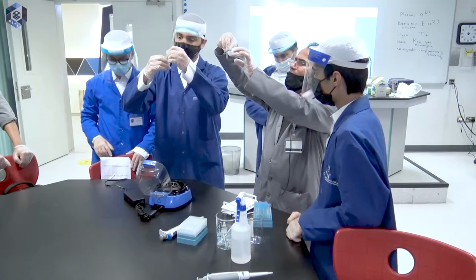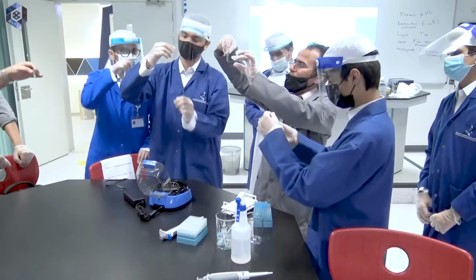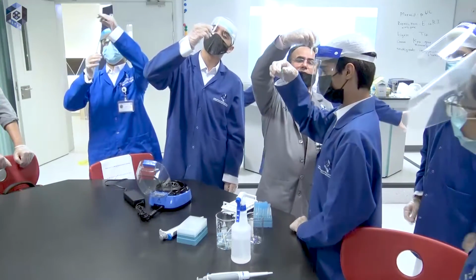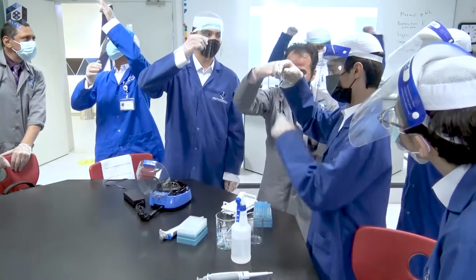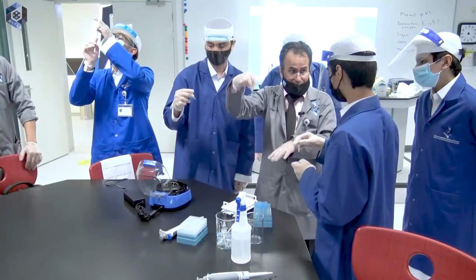We have 2 layers, one clear layer and the other one is turbid beneath it. Can you see the 2 layers? Yes. Water and bacteria. Now we are interested in which of these 2 layers? The upper one or the lower?